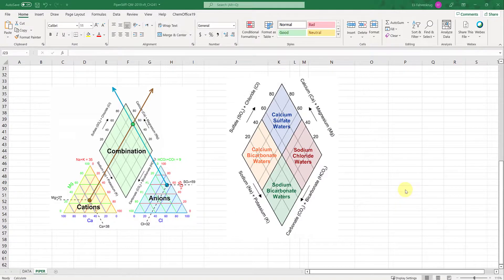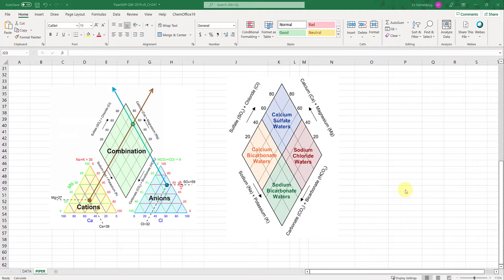This video walks you through how to generate Piper Trilinear diagrams which are enormously useful in evaluating differences in natural water samples, especially groundwater samples.